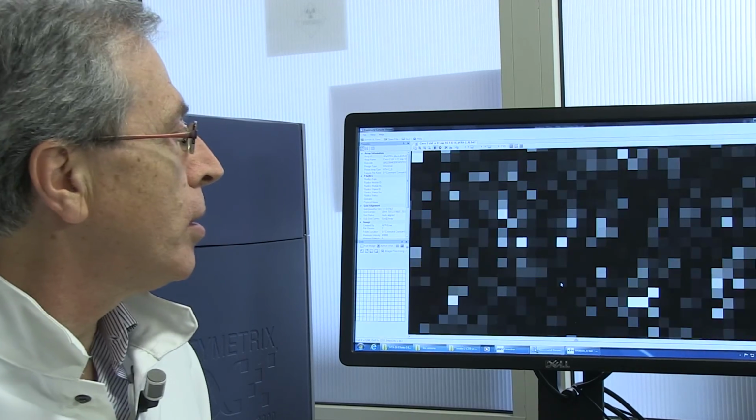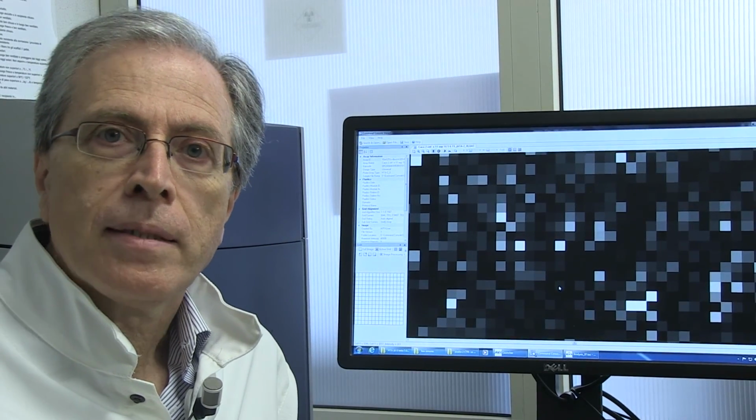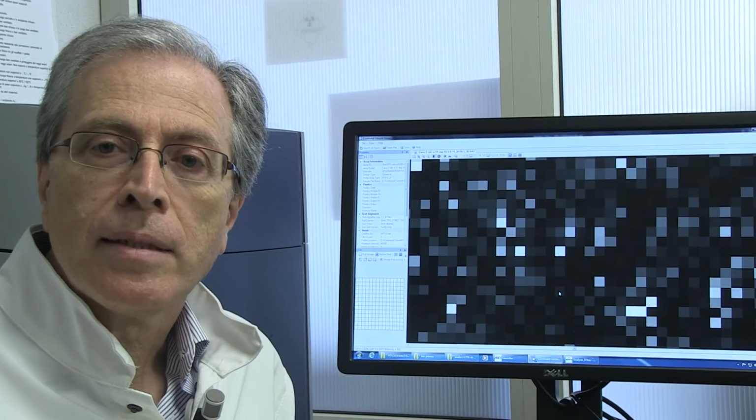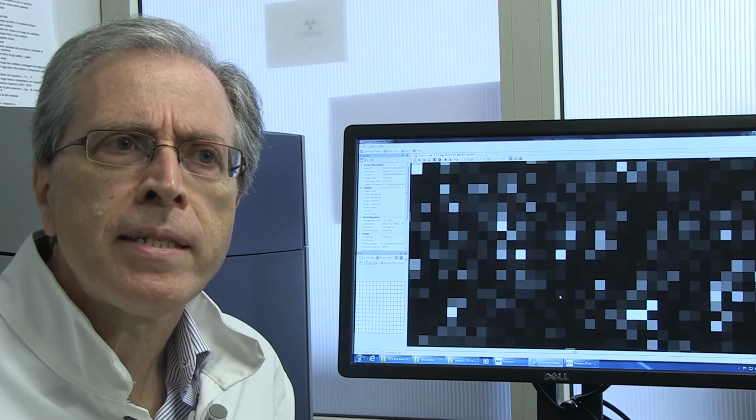The average intensity values per probe cell are here expressed in a pseudo-color scale or in a gray scale. But we know that in a microarray there are 6 million probe cells, and on average 100 probe cells correspond to a single transcript.